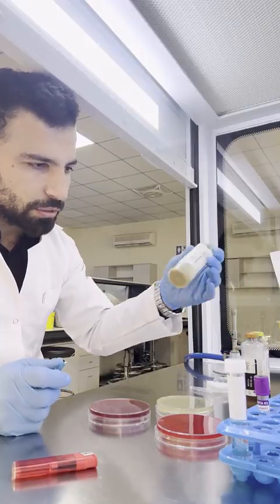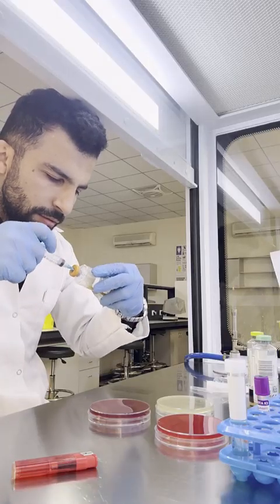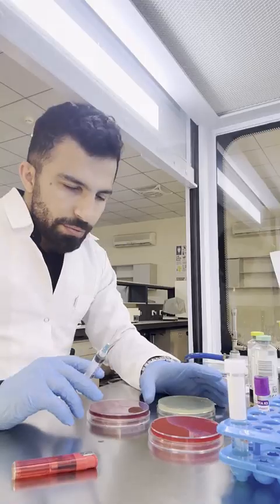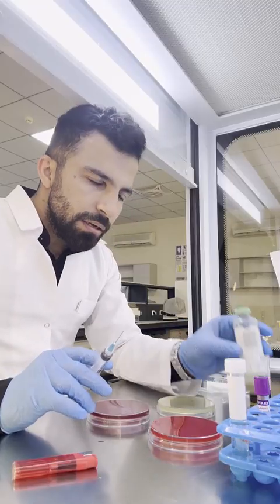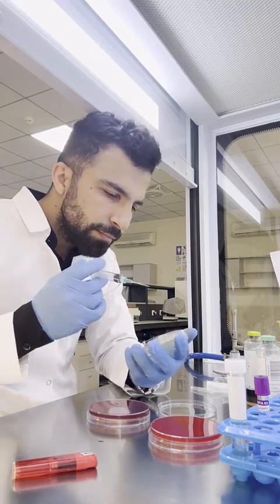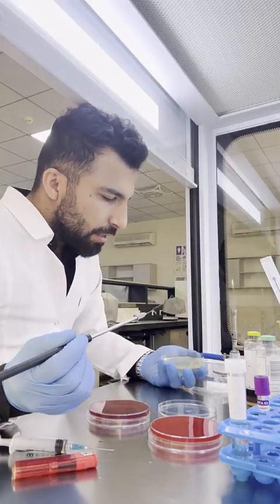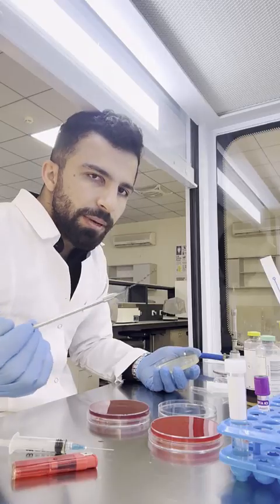We're going to culture this blood, which we take from the bottle, on the plate. We're going to place one drop here, and then the streaking technique will be the interrupted streaking, which I explained in the lecture.